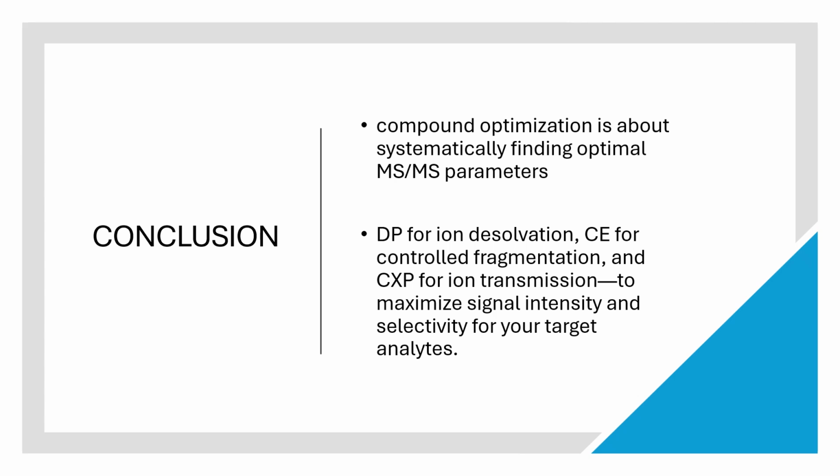In part 2, we'll discuss chromatography optimization and achieving optimal separation for your analytes.